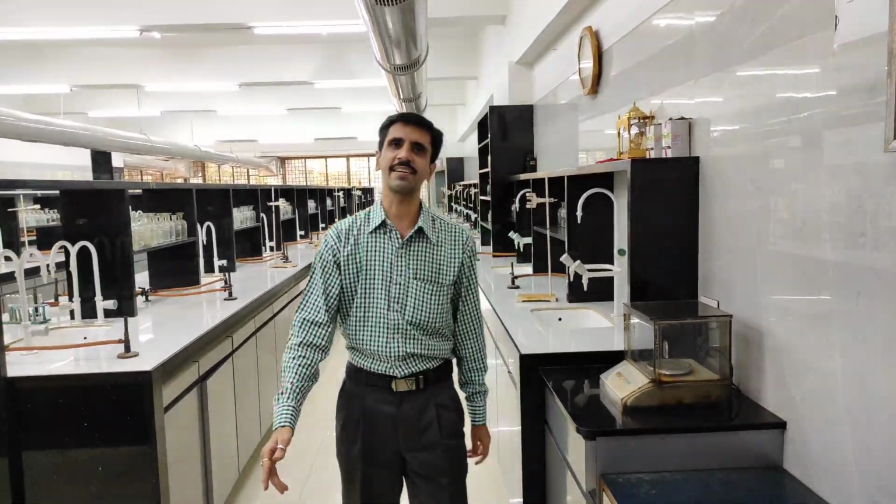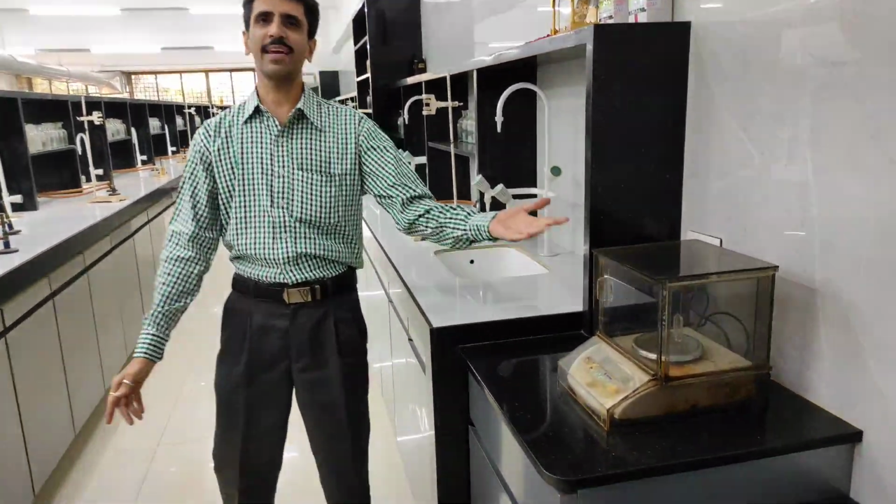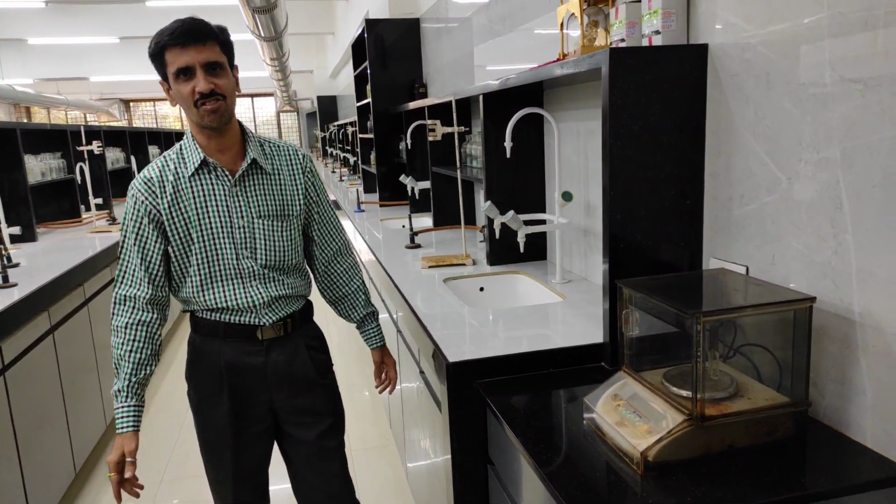Before we actually start, I want you to go through the entire lab. That is what is called a lab tour. So come on, my dear friends, have a look at the laboratory. Here we start. This is the weighing balance.